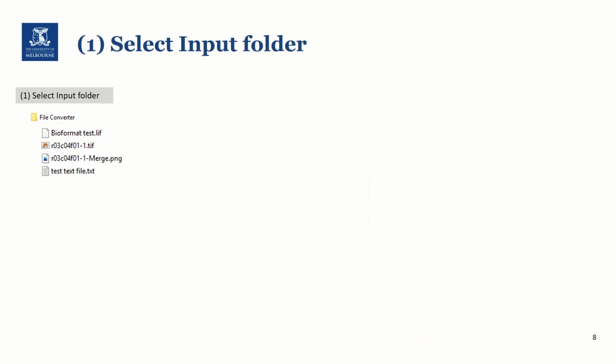So now we know the entire workflow, let's go and start writing this step by step. And don't worry if you have missed any steps or need more time to digest information. Similar to previous days, you can replay this video from our YouTube channel or follow the instruction PDF to work at your own pace this afternoon.